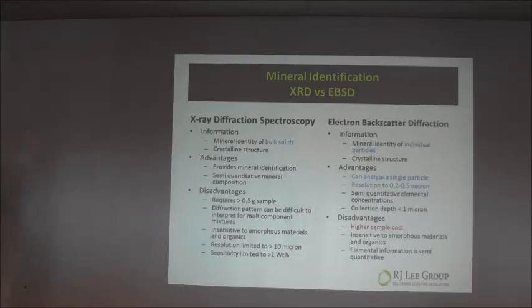This is a detection technique that's used with SEM that gets around some of the disadvantages of X-ray diffraction. With EBSD, you can actually look at individual particles, where you can look at very small areas on a pipe or a metal line and characterize the crystalline structure and so forth. The resolution, again, is quite good compared to X-ray diffraction. Very good technique for looking at very, very small samples.